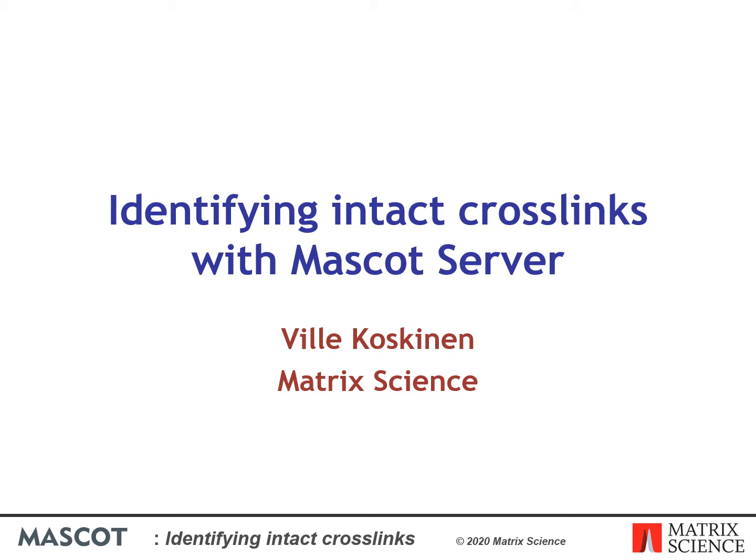A new feature in Mascot Server 2.7 is the ability to identify cross-linked peptides from MSMS data. I'll show you how to use the new feature and discuss validating cross-linked search results.